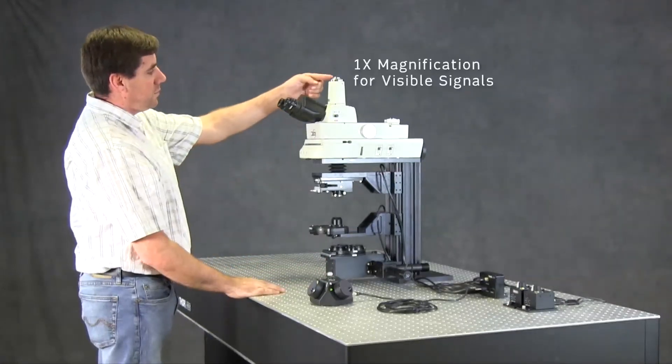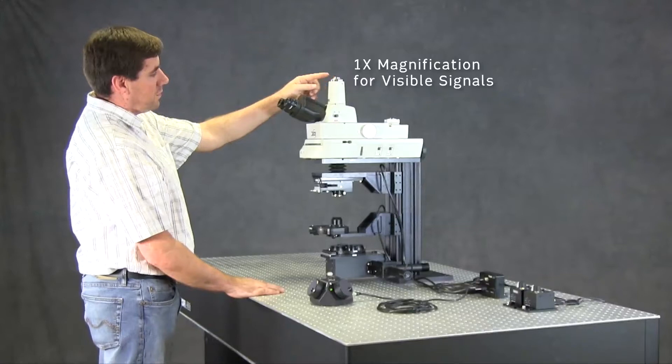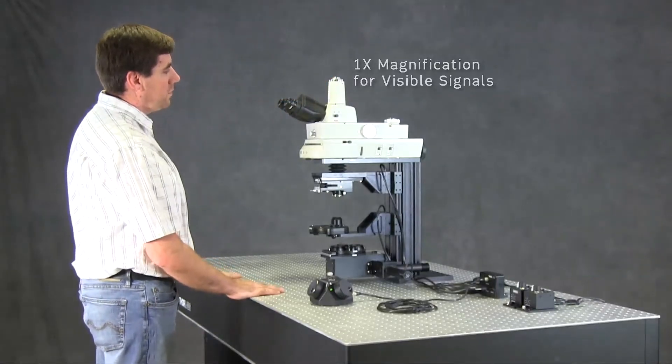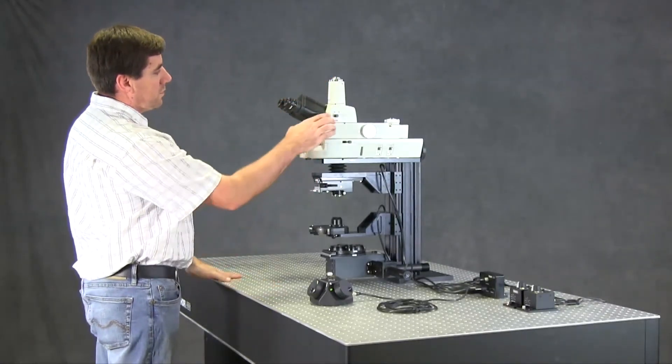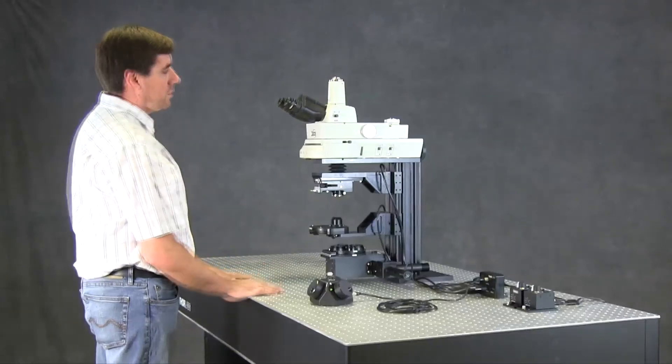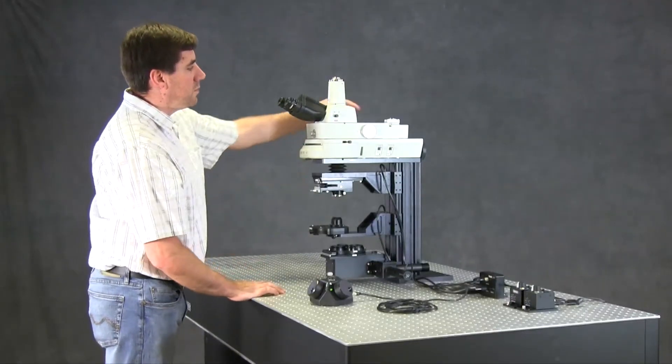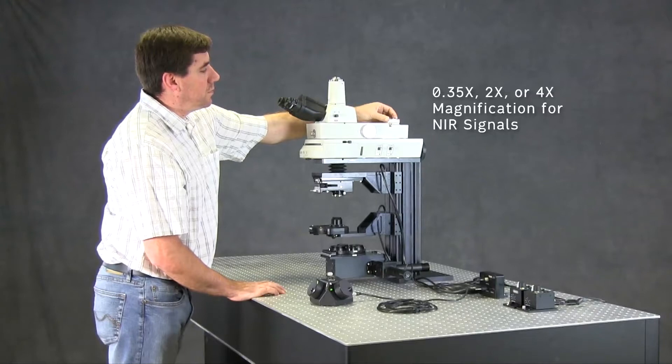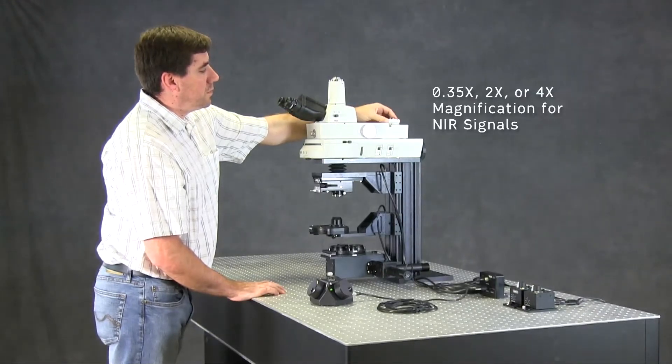The front camera port receives visible signals and has 1X magnification, and the knob on the side sends the image to either the trinoculars or the camera. The rear camera port receives NIR signals and has a rotating ring for fine focus adjustment.